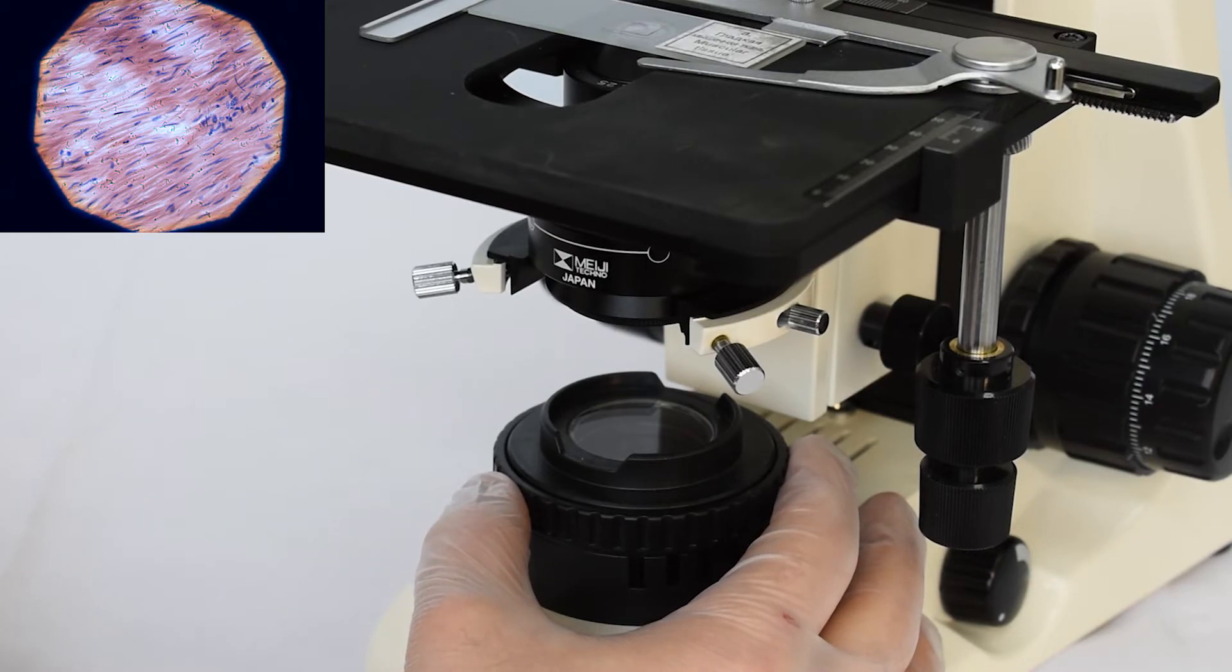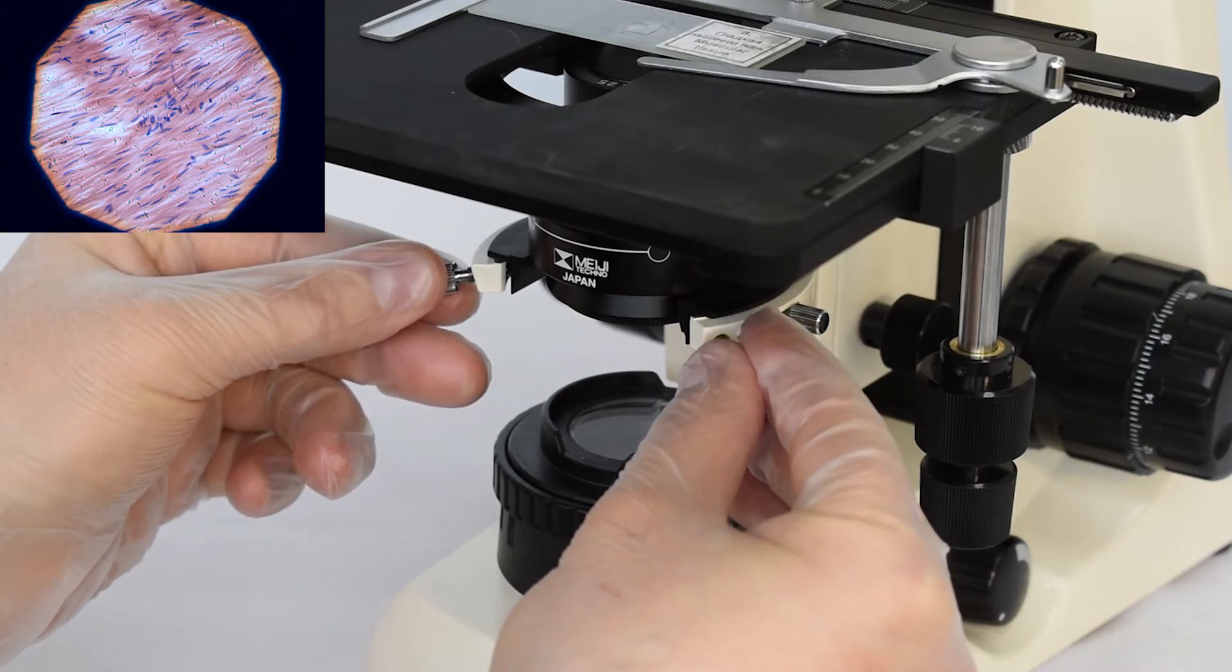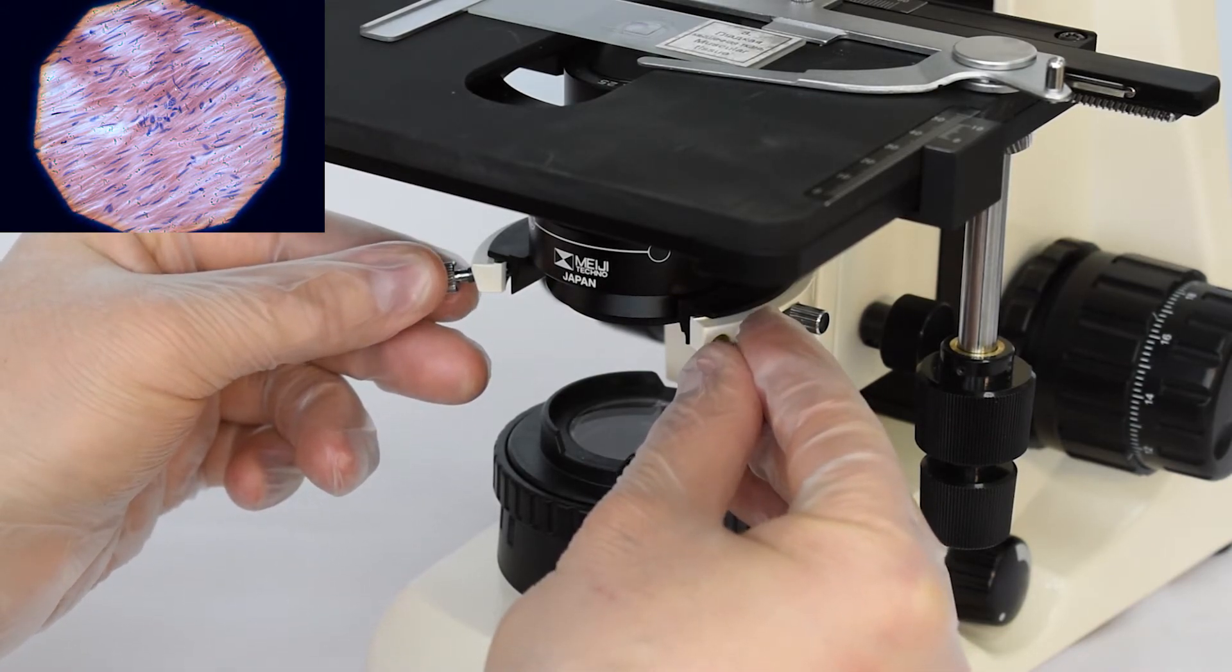In the process of centering the field diaphragm needs to be opened a little, after which if necessary the position of the condenser is adjusted again.